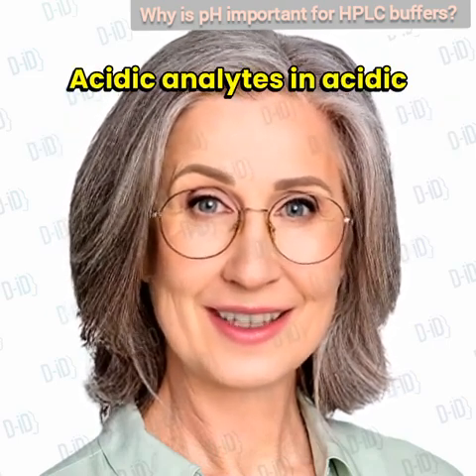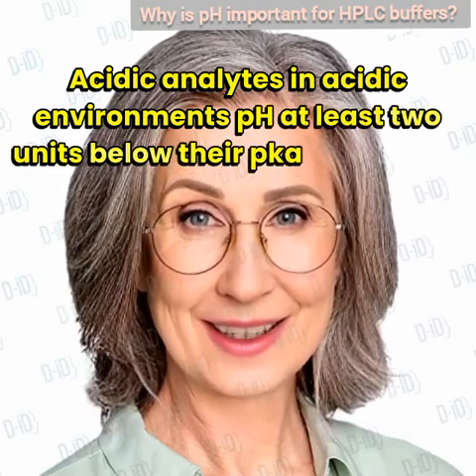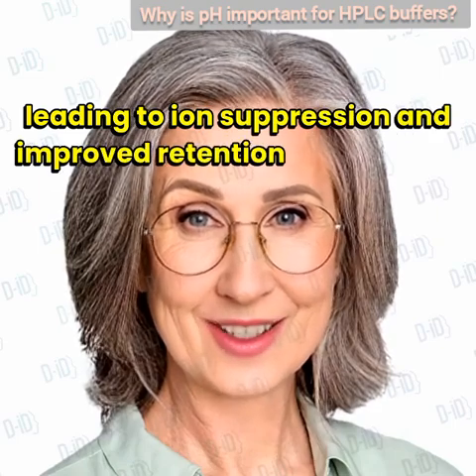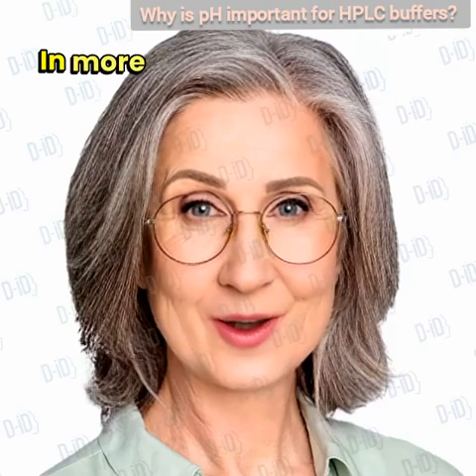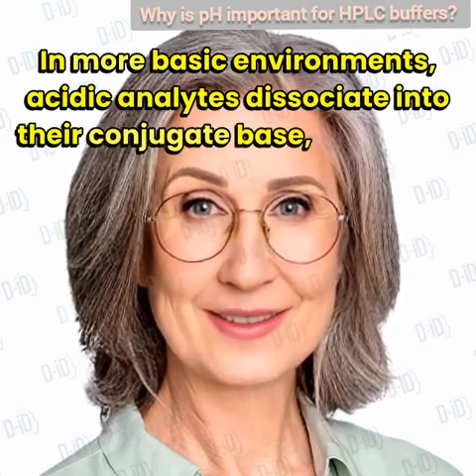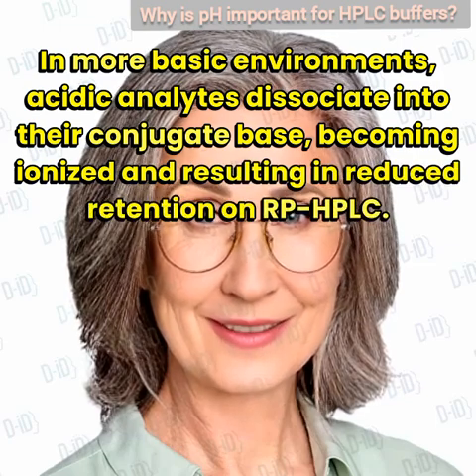Acidic analytes in acidic environments, pH at least 2 units below their pKa, retain their protons, leading to ion suppression and improved retention on HPLC. In more basic environments, acidic analytes dissociate into their conjugate base, becoming ionized and resulting in reduced retention on HPLC.